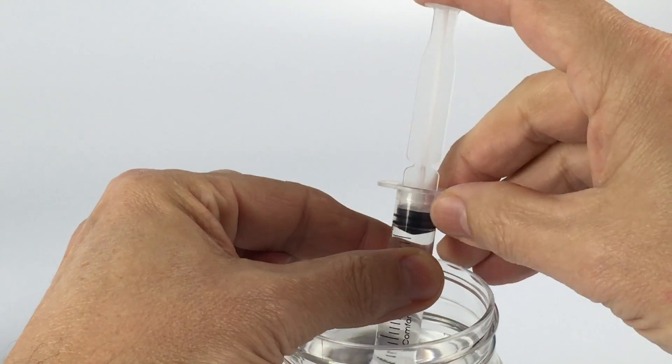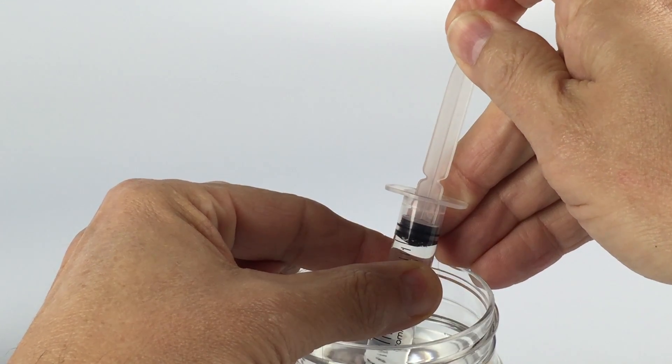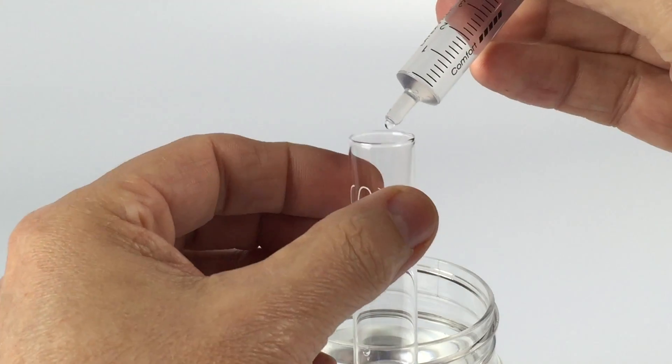You want exactly 5ml of water in your syringe with no trapped air between the plunger and the 5ml mark. Add this to your test vial.